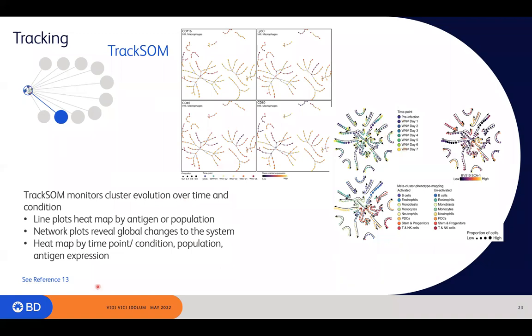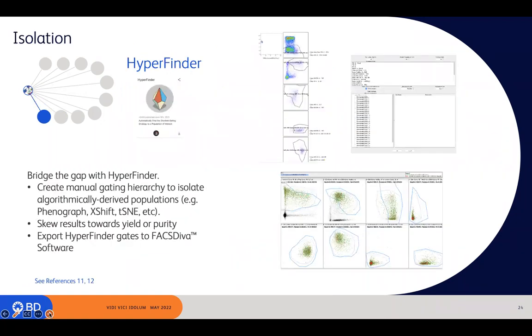So I think this is a pretty cool tool. For us in our toolbox, we haven't had a tracking tool that monitors how those clusters are changing from one time to the next, and I think it'll make quite a nice new tool for you all to use in the very near future.